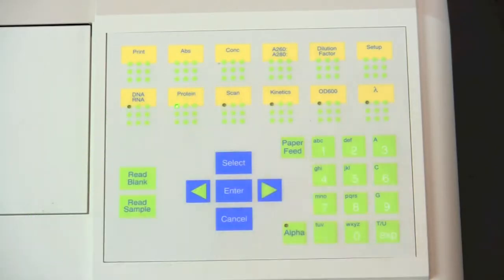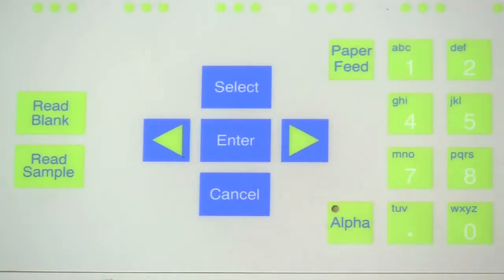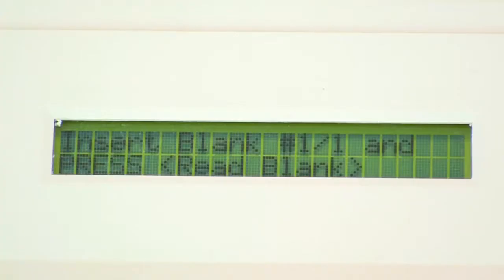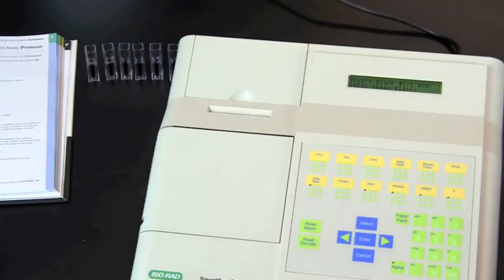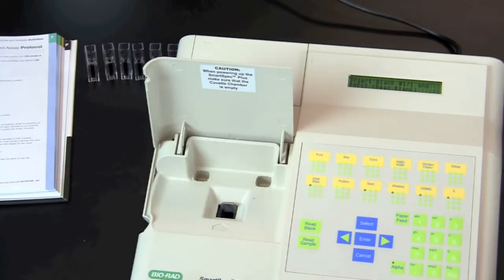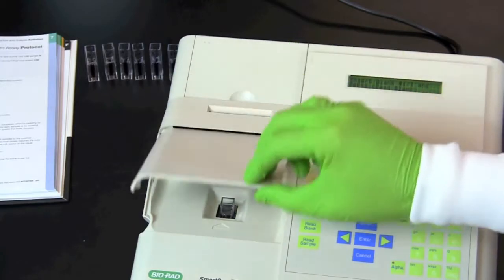To determine the protein concentration using a spectrophotometer, select for the Bradford assay. When asked to insert blank into the spectrophotometer, insert the cuvette labeled control. Use the blank to set the spectrophotometer to zero absorbance or 100% transmittance.